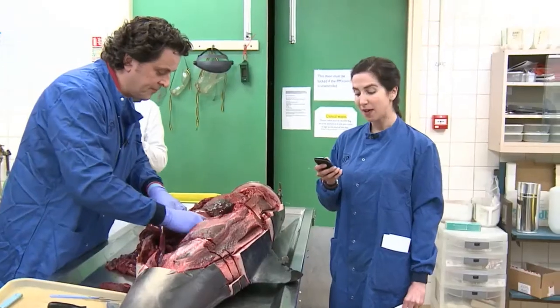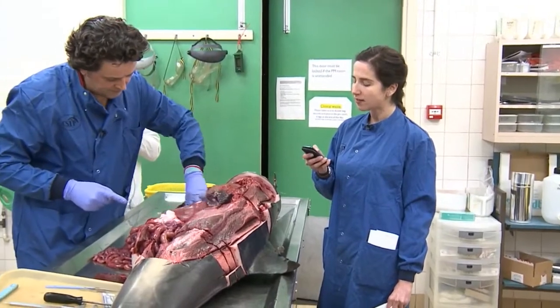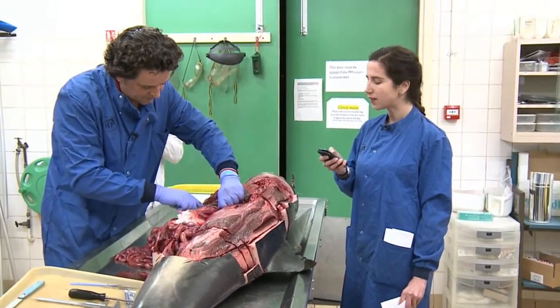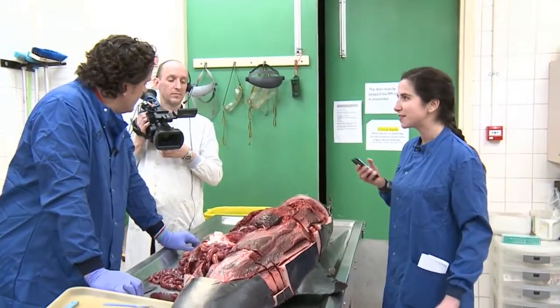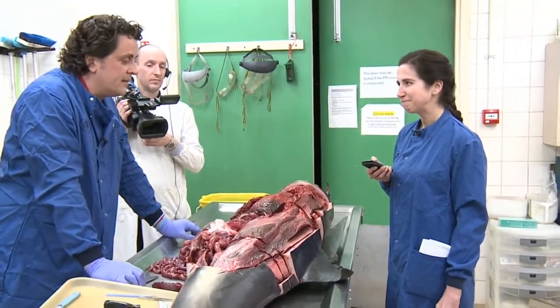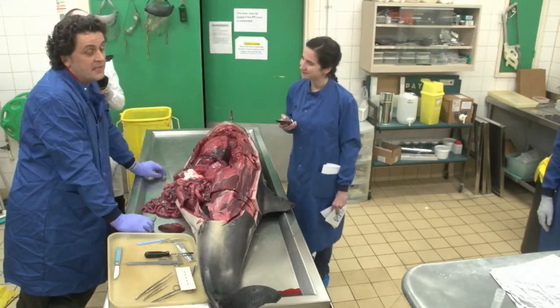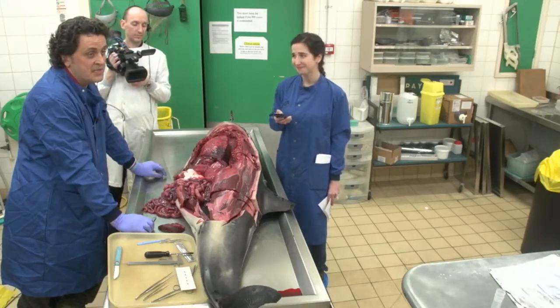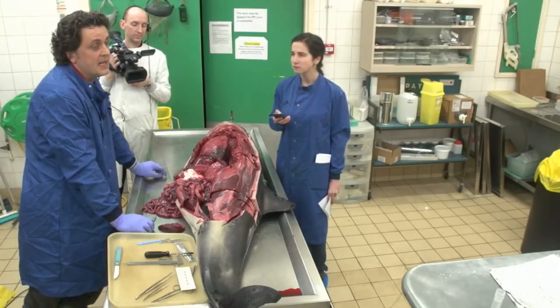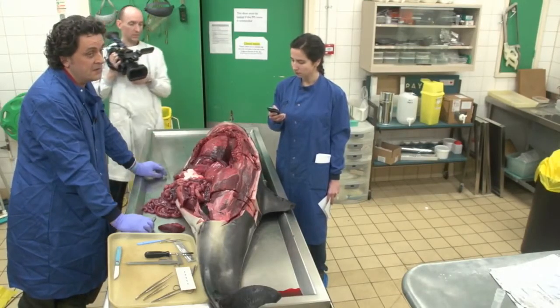Okay. We've had a question through by email from Wahaj. Thank you very much for that. This question is, what happens to the dolphin after the necropsy? So we have seen various bits going into bags. Yeah, good question. From our perspective, all the bits of the animal, not to put too fine a point on it, will be sent away for incineration. Because they're CITES listed, that's the advised method of disposal here at this end.